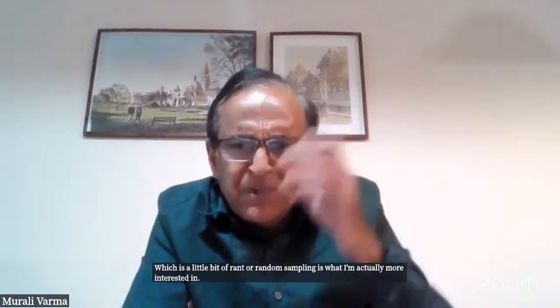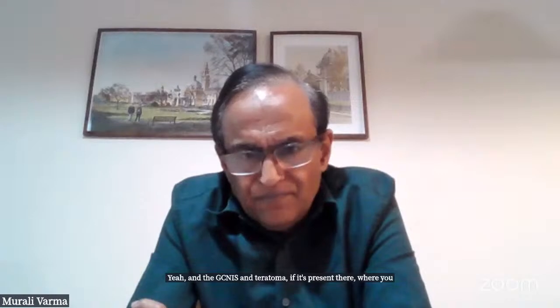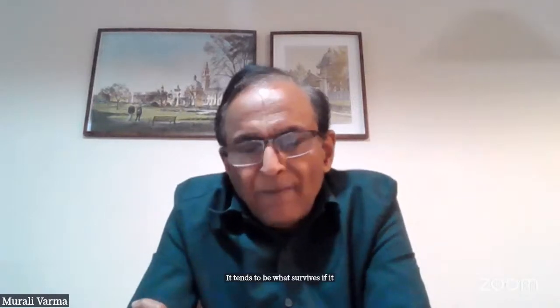Yeah, I think that's GCNIS and teratoma, if it's present, where you find a small cystic focus or something. It tends to be what survives if it's a post-chemotherapy one.